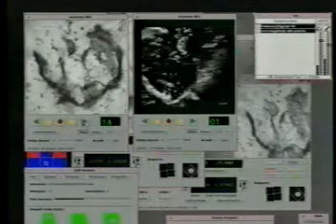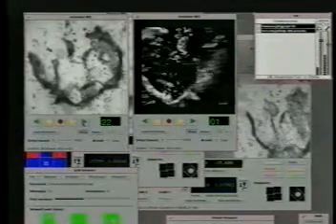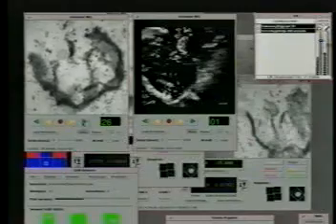It's the organelle within the cell that is responsible for adding sugars to newly manufactured proteins, thereby labeling them for delivery to the proper destination within the cell. The two applications that we're going to be demonstrating for you are called Grid Browser and Survey. We'll get started with Grid Browser.